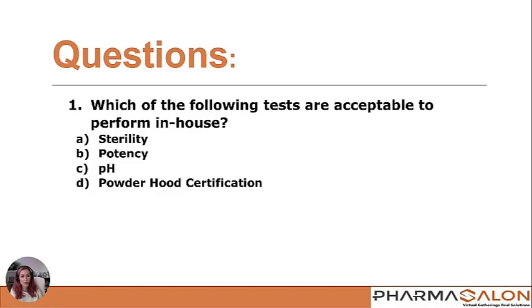If you were thinking option C, pH, you are correct. pH is very commonly performed in-house. In fact, it has to be when you're adjusting the pH of any formula.